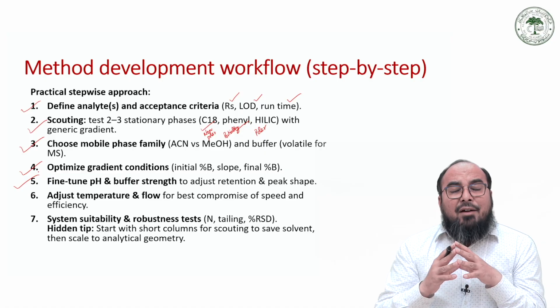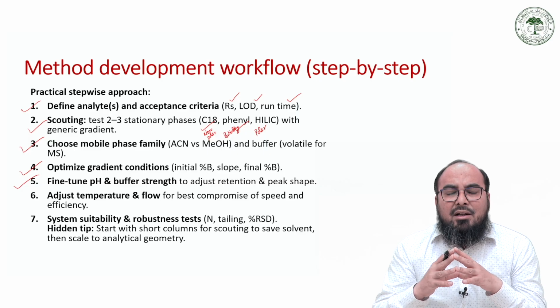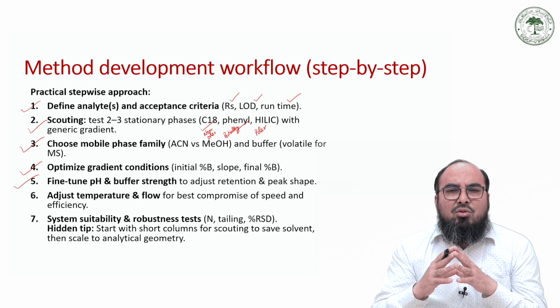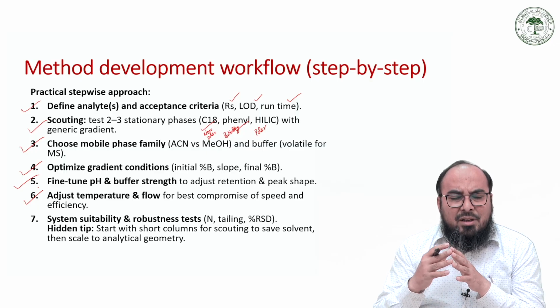Similarly, you have to adjust the temperature and also the flow of the mobile phase, so that you can get the optimum velocity of the mobile phase and the best reproducible temperature, so that every time you will get the same number of analytes contained in your mixture.